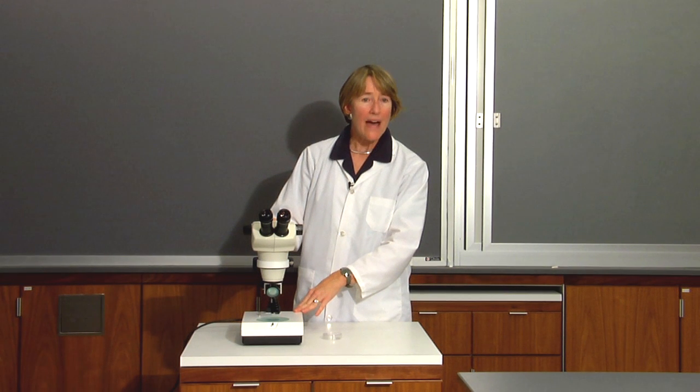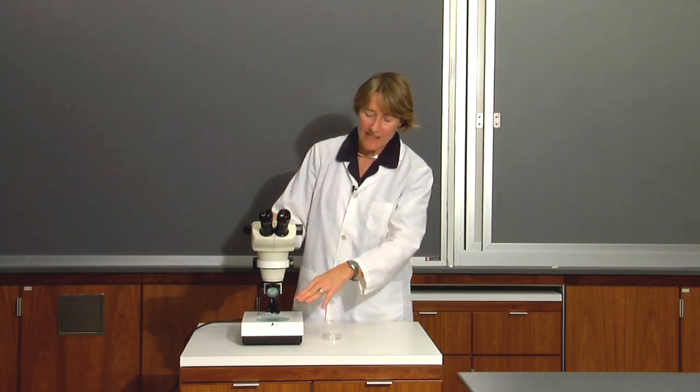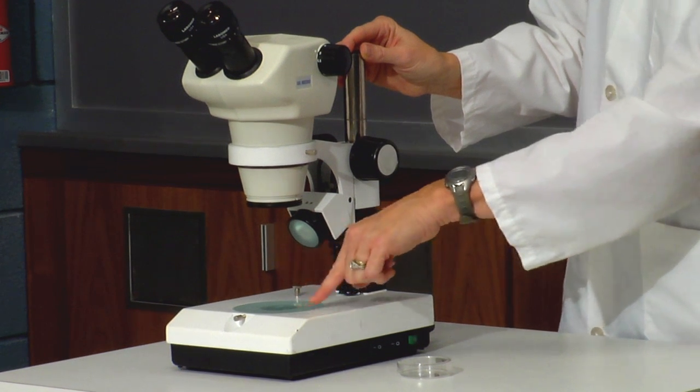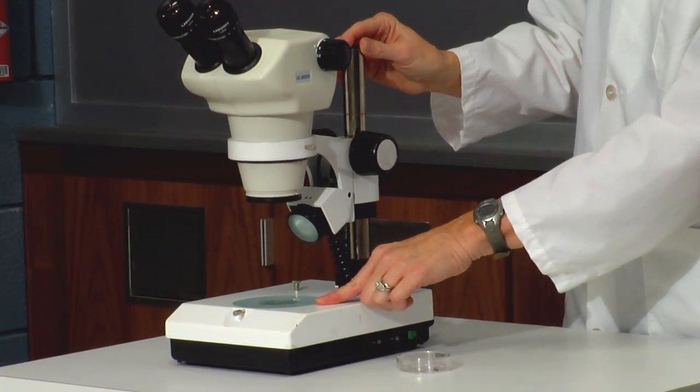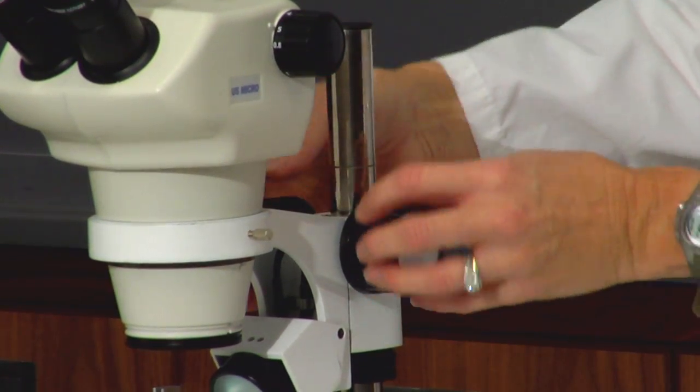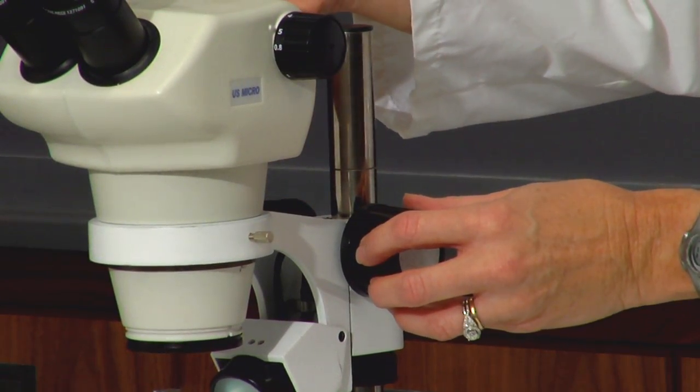I'd like to talk a little bit about the parts of the microscope. This is the base, which contains the stage where you put your specimen. This is the arm, which is what you hold onto, and the arm is what holds the main part of the microscope.